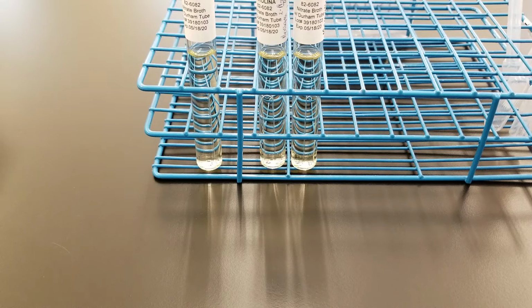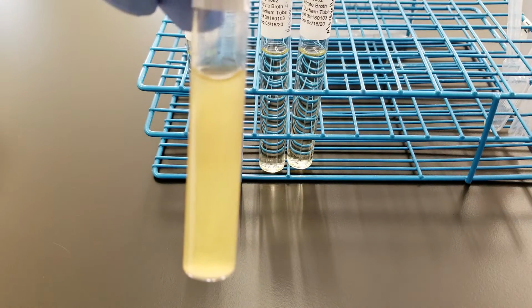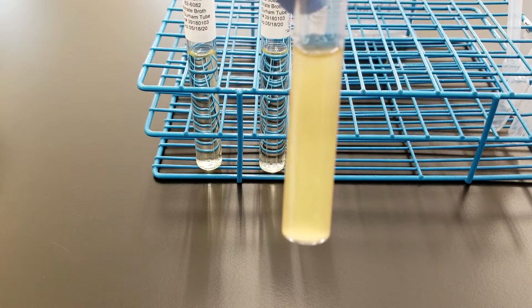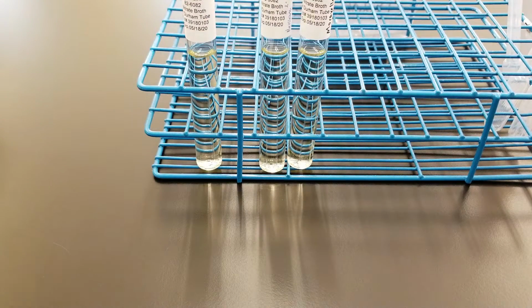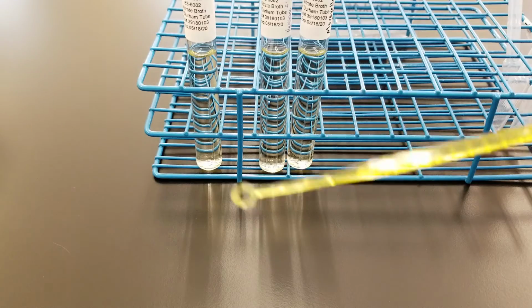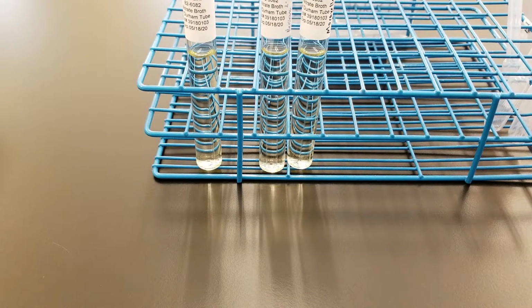So the way that you can inoculate an organism into the nitrate reduction broth can either be from, hold on, I'm getting it, either growth broth. This is thio, and we have an organism that was in there from a stock culture. Or you can take 2 drops of that, or you can take a loop and get a couple colonies or a loop full of the organism and put it in there. So that's how we went.